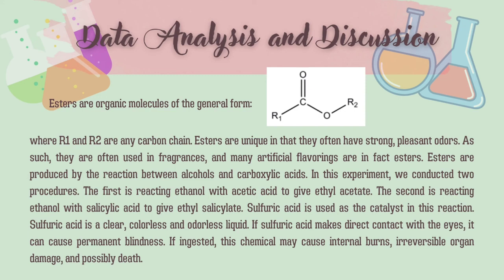Sulfuric acid is a clear, colorless, and odorless liquid. If sulfuric acid makes direct contact with the eyes, it can cause permanent blindness. If ingested, this chemical may cause internal burns, irreversible organ damage, and possibly death.